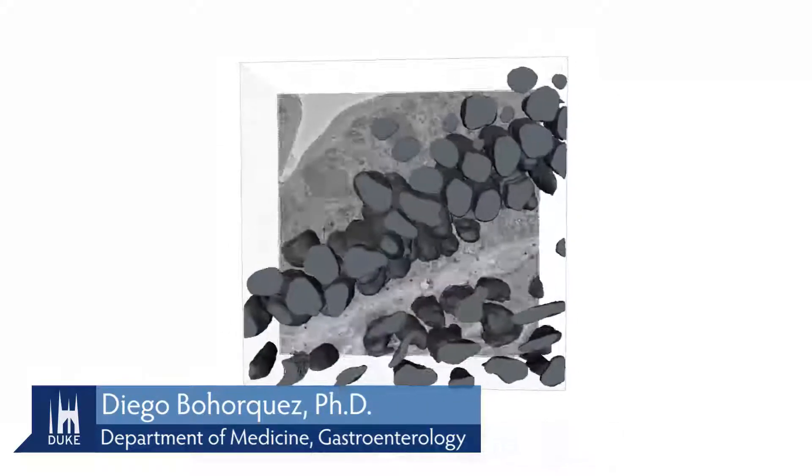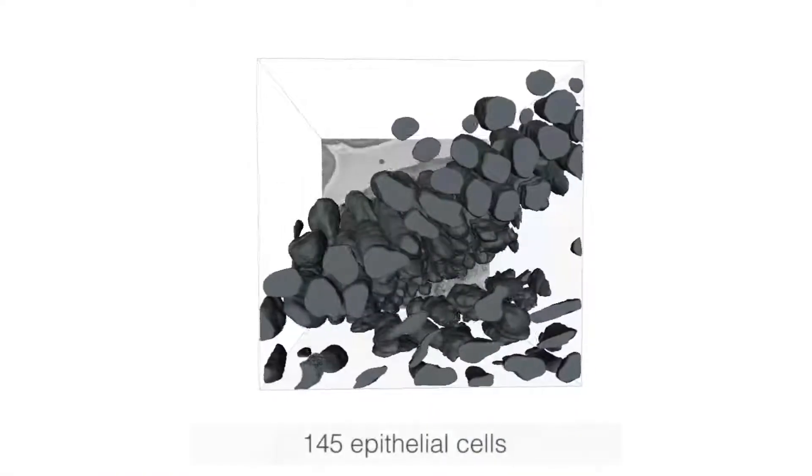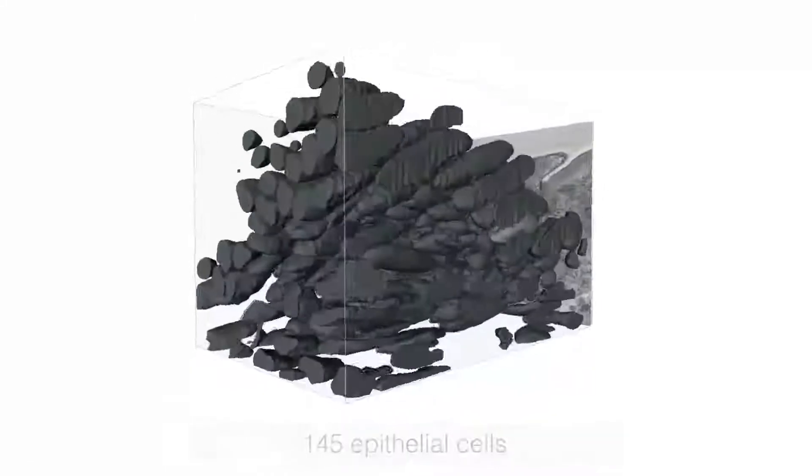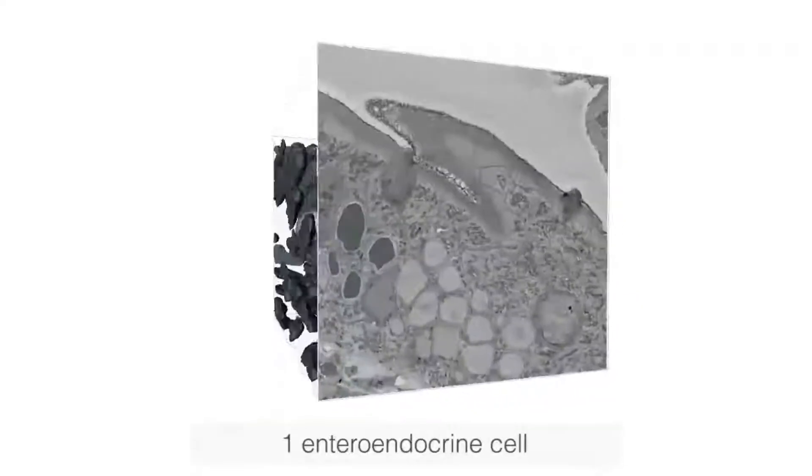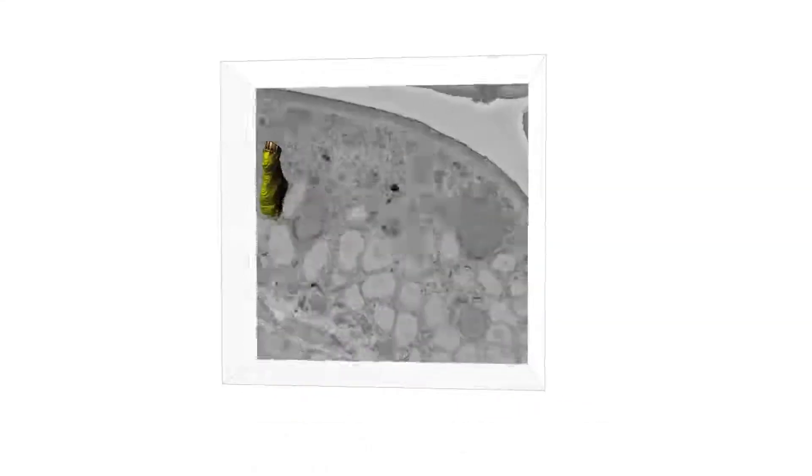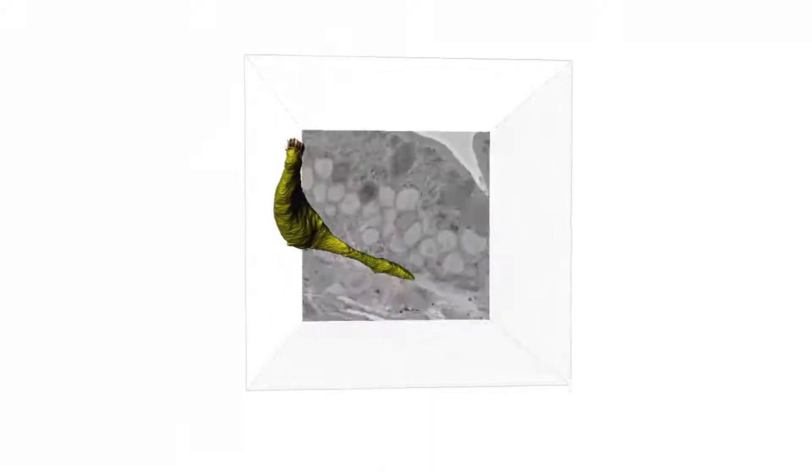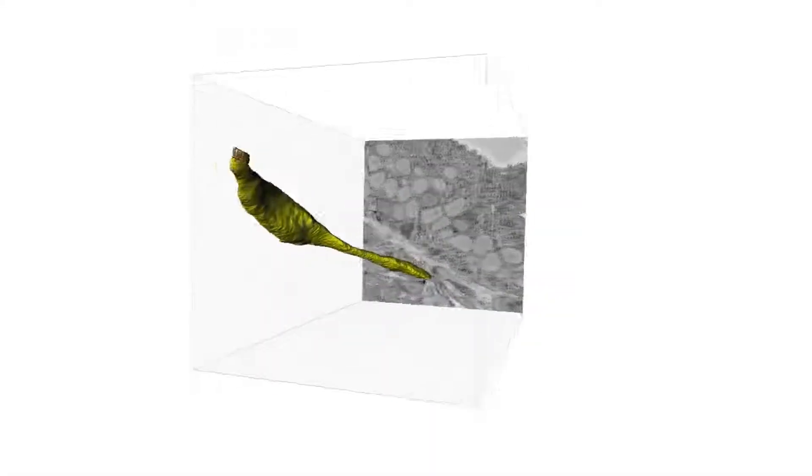Here we have a cube of gut tissue that has been reconstructed. It is a series of 700 micrographs. In gray, we're seeing the nuclei of those cells in the epithelium and below in the lamina propria.